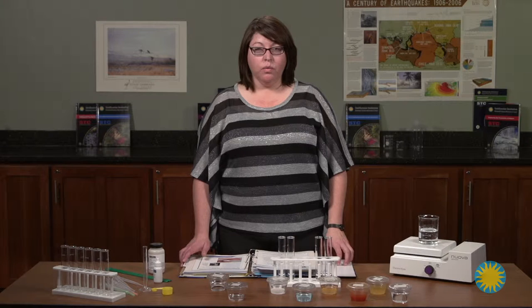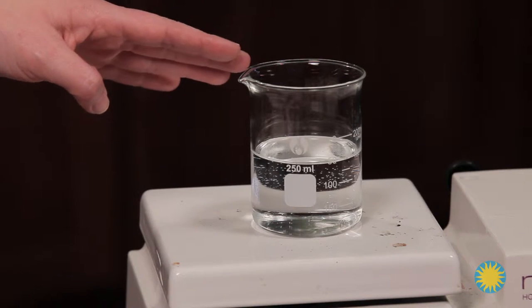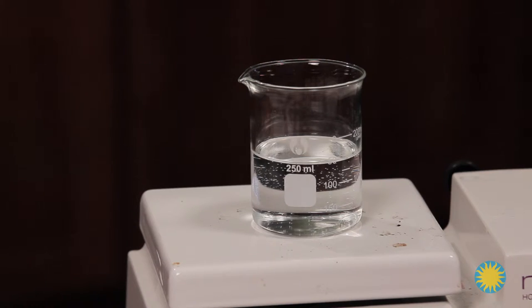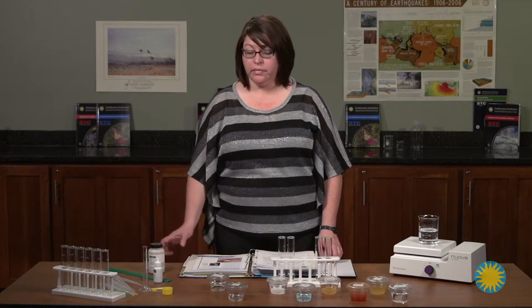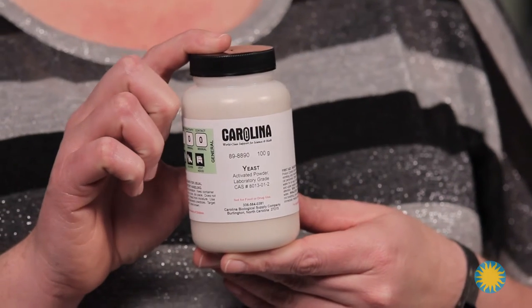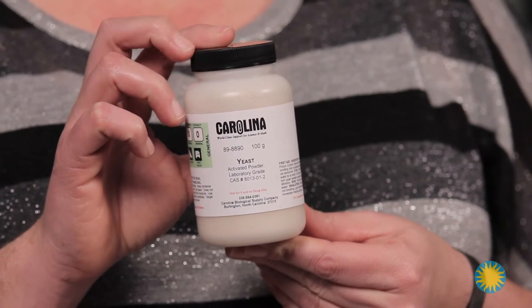Make sure to have very hot water ready for use. I have a 250 ml beaker with water sitting on a hot plate — it works better if the water is at a slight boil. Use yeast immediately after opening or put it in the refrigerator, otherwise the cells will become inactive.